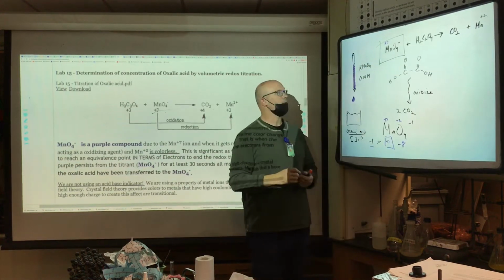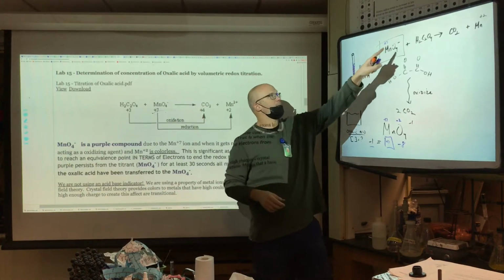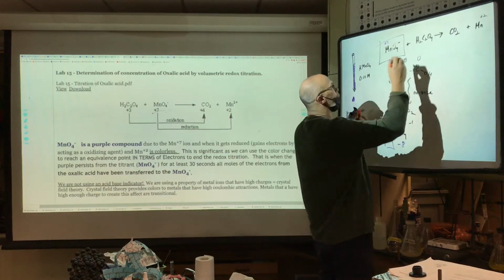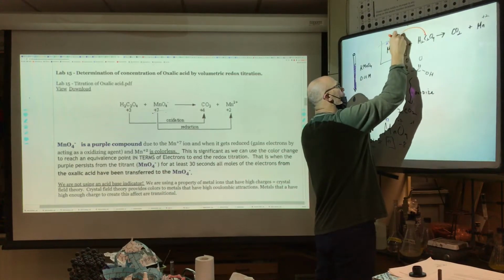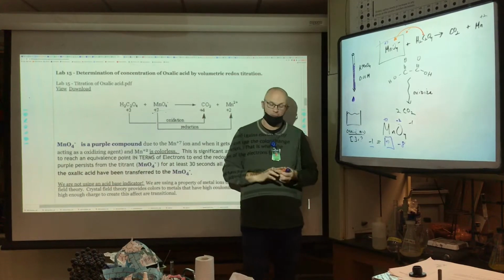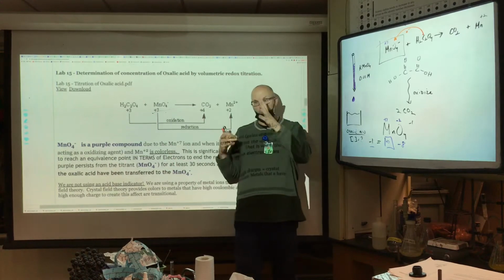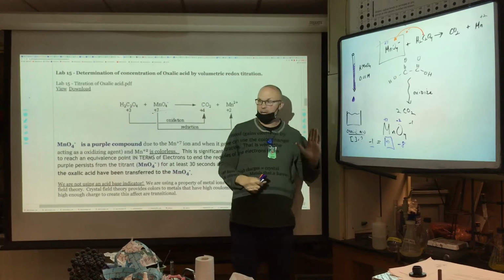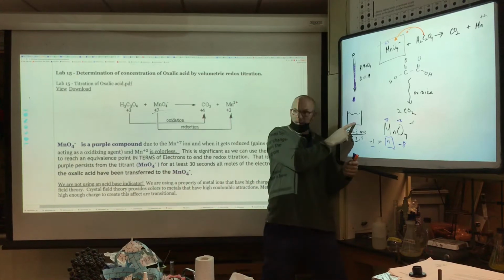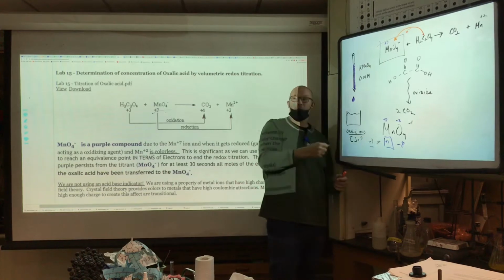And so clearly, in order for plus 7 manganese to become plus 2, it's got to rip not protons but electrons away. It's going to force the hand. If we're doing a titration, whether it's acid-base or redox, this is a driven reaction. So to analyze the analyte, we're going to force its hand by ripping electrons.